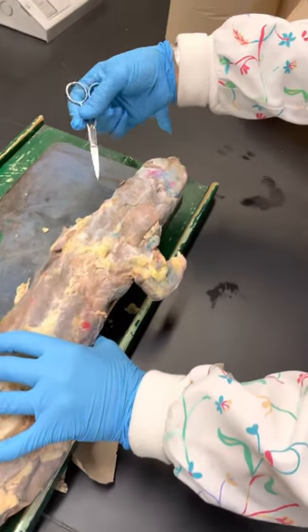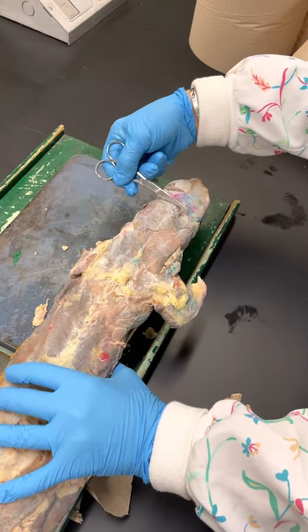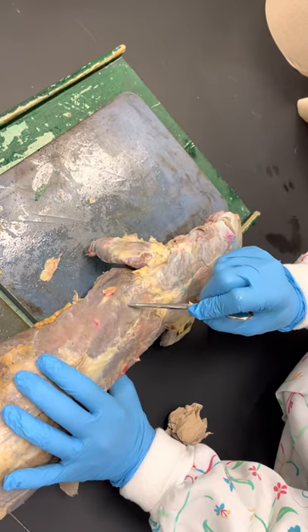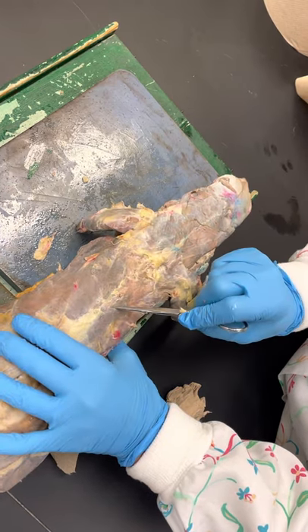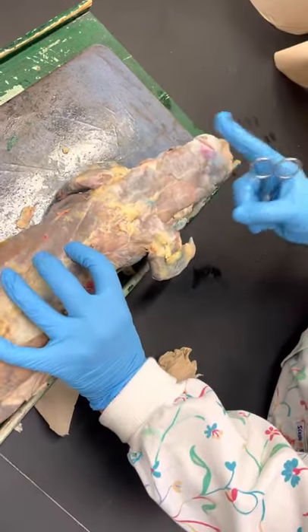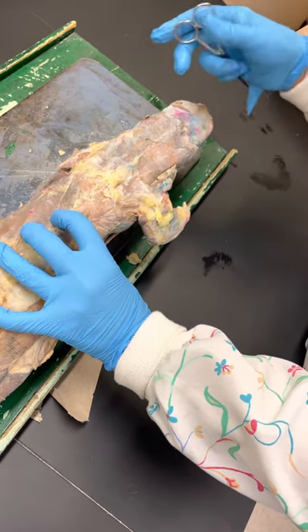Remember we have the trapezius — they have three of them. This one along the whole back of the neck is called clavotrapezius. Then around their shoulder blade is acromiotrapezius, like the acromion process. And this little triangle delineated by white lines is the spinotrapezius. So their trapezius goes all the way from here down to here, all attached like ours, but they call it three different names because they can move them slightly differently.